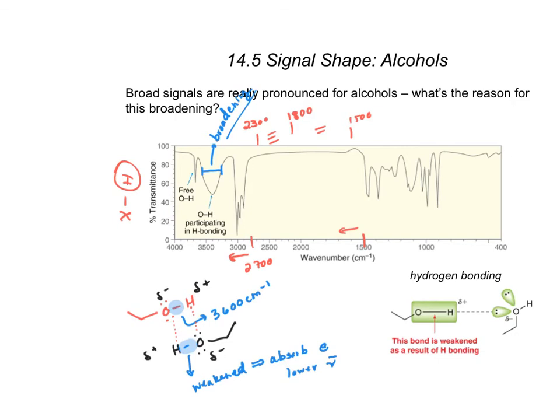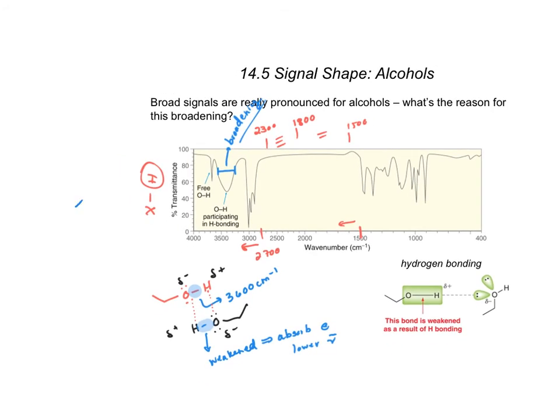Alcohol, right? So if you look at an IR spectrum and you see this broad signal that is about 3200 to 3600, it is an alcohol group. Okay, it is an alcohol. So again, OH: if you see absorbance, a nice broad signal between 3200 and 3600 inverse centimeters, it tells you there is an alcohol present in the molecule, okay?